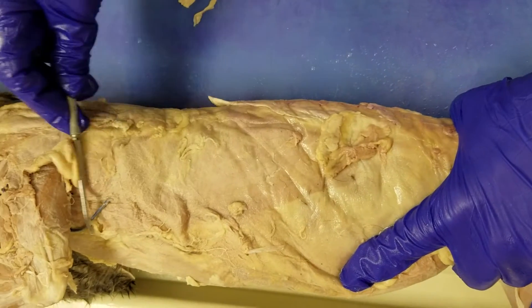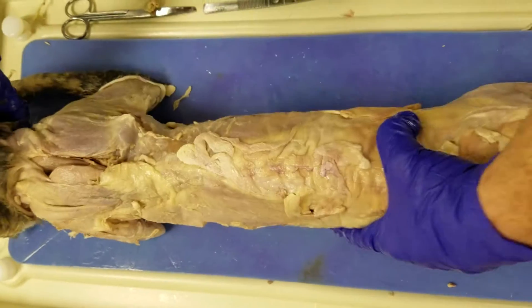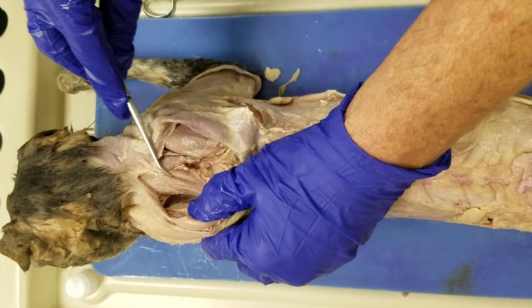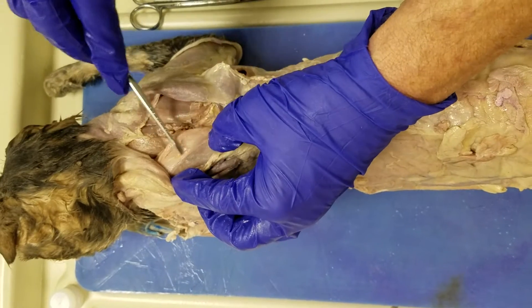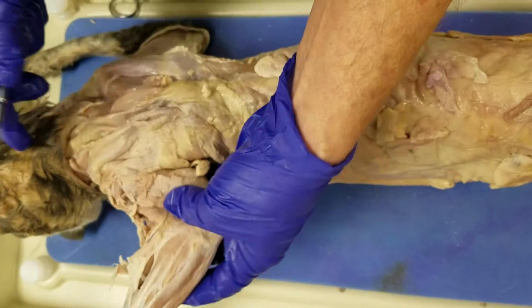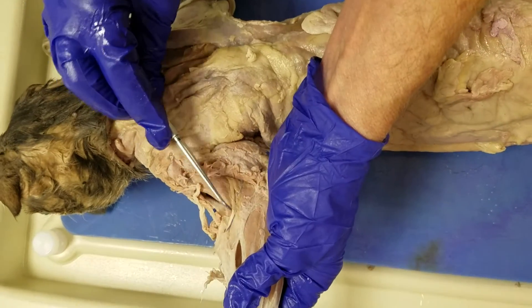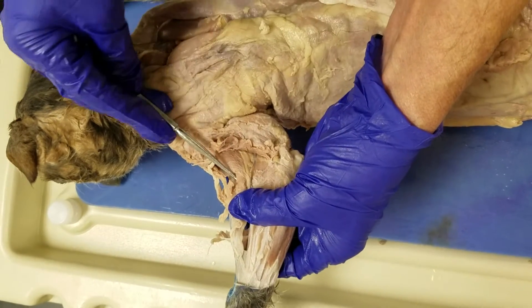Latissimus dorsi, trapezius, rhomboideus, subscapularis, supraspinatus, triceps brachii, deltoid, brachialis, and brachioradialis is right there.